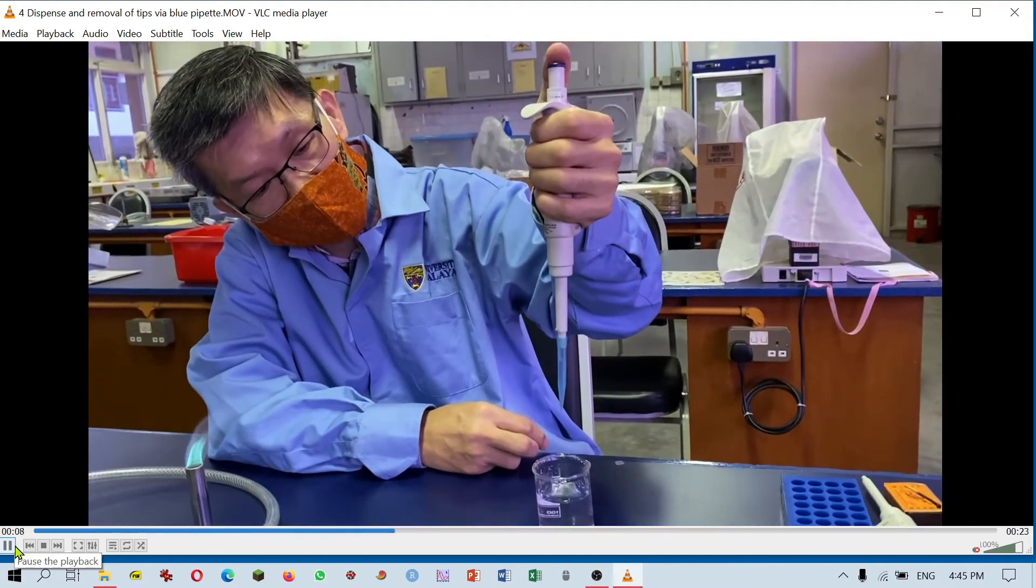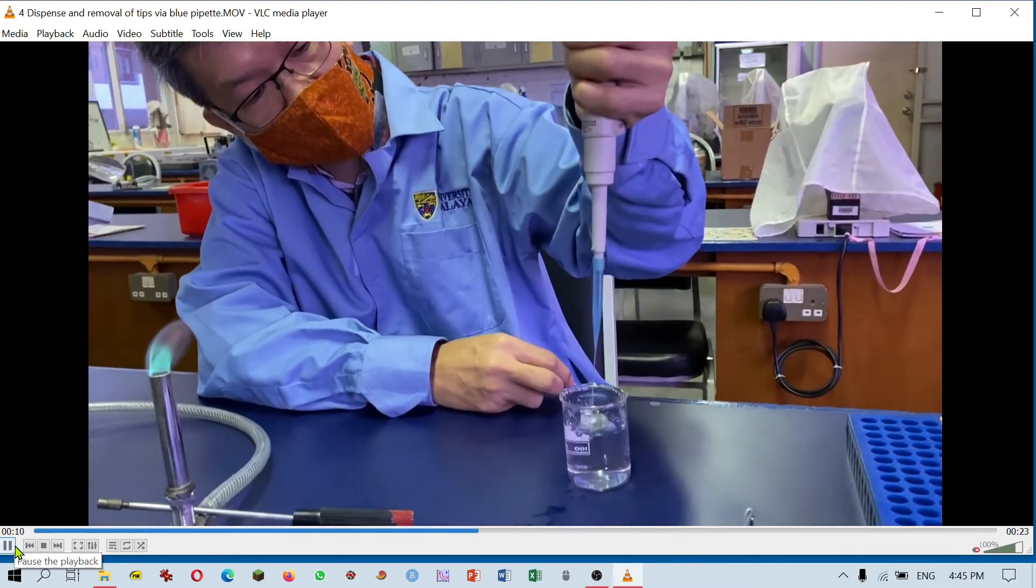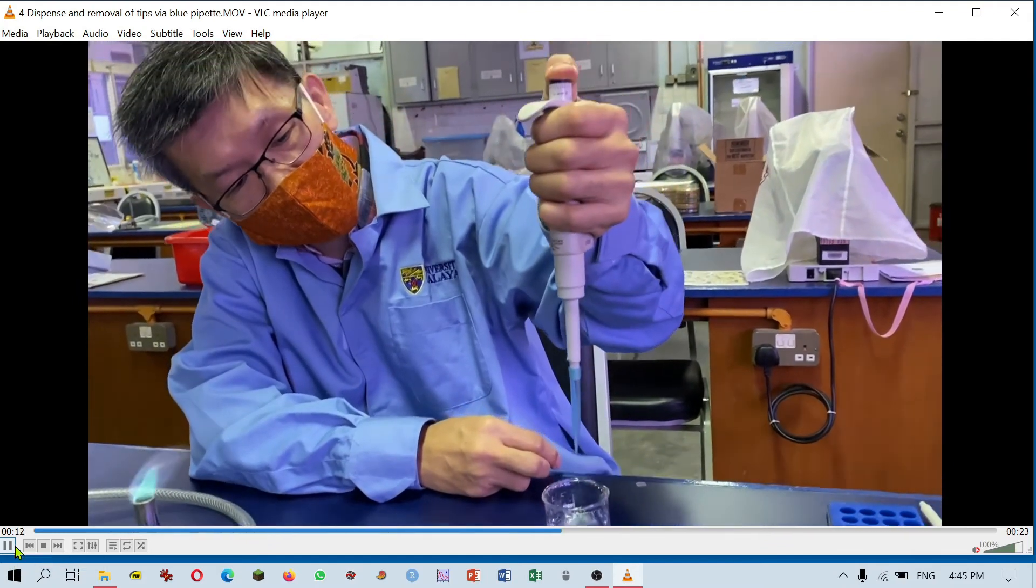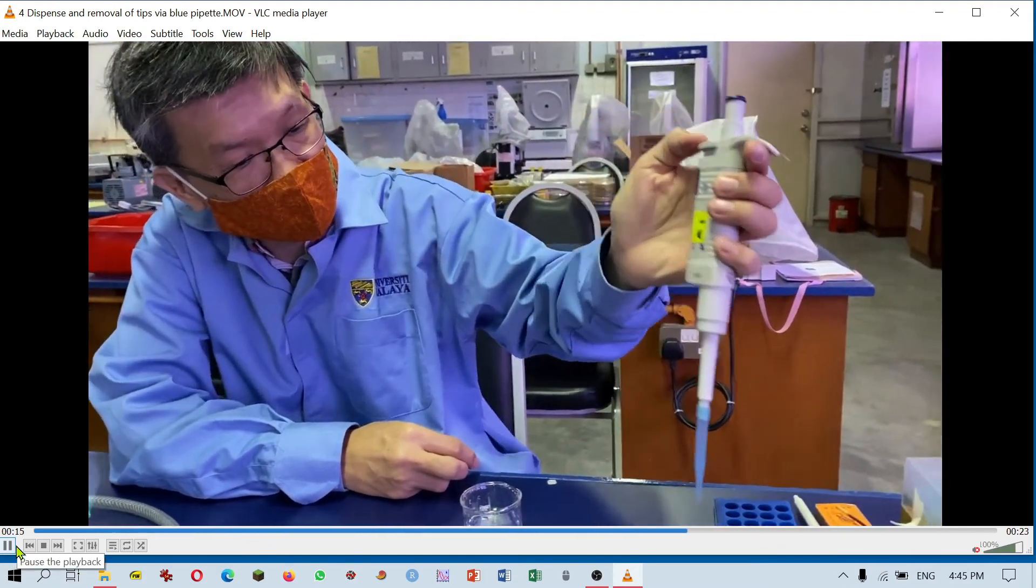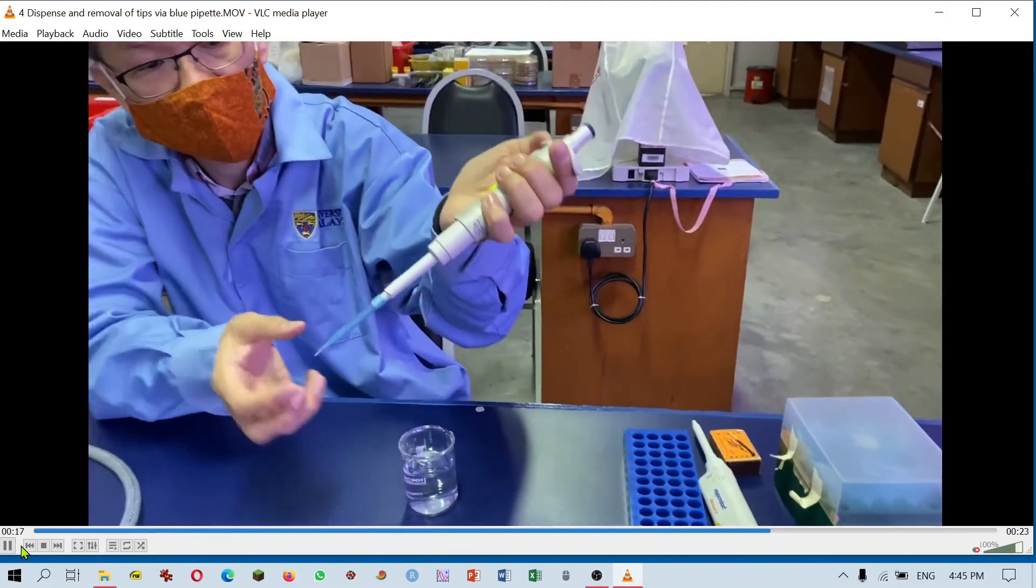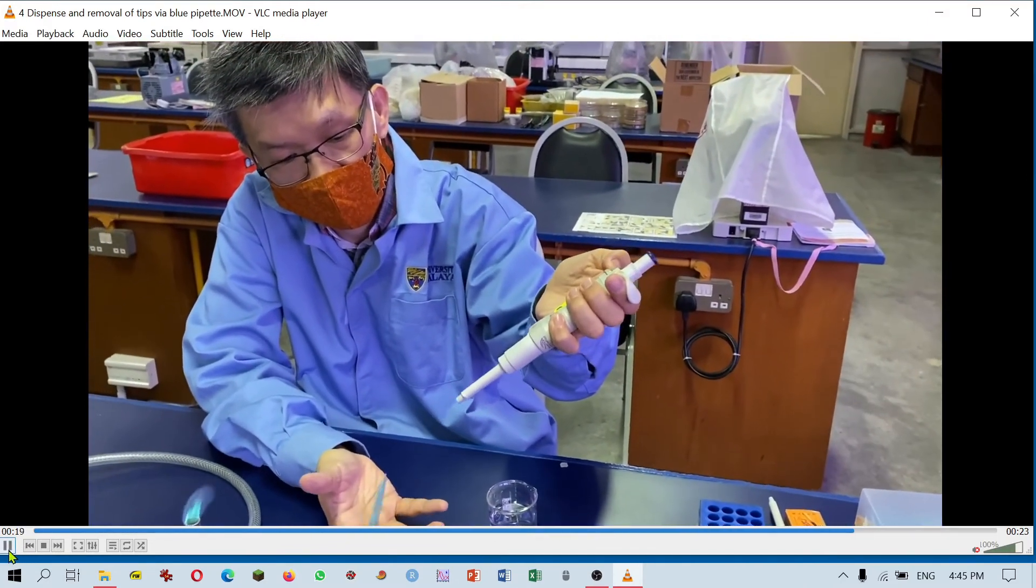To dispense, you press it all the way down to the second stop. Then press the button at the back, the ejector button at the back.